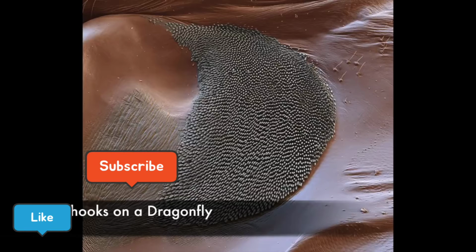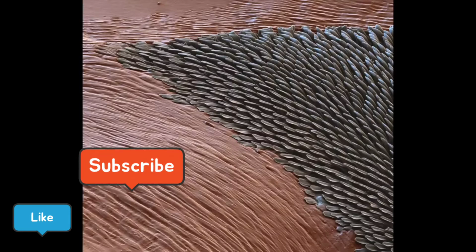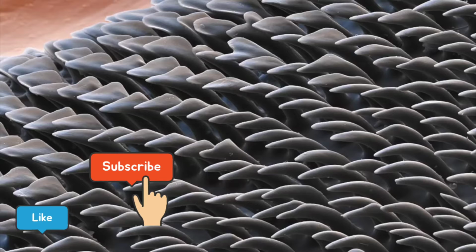These are microhook fasteners, similar to Velcro, on the neck of a dragonfly. These structures allow the dragonfly to lock its head during the fast flying and maneuvering needed to capture its prey in flight.